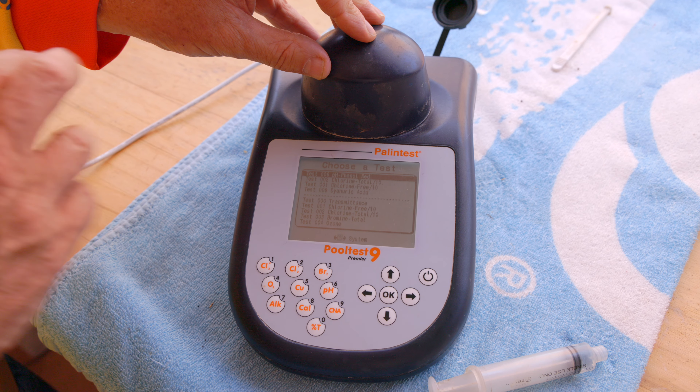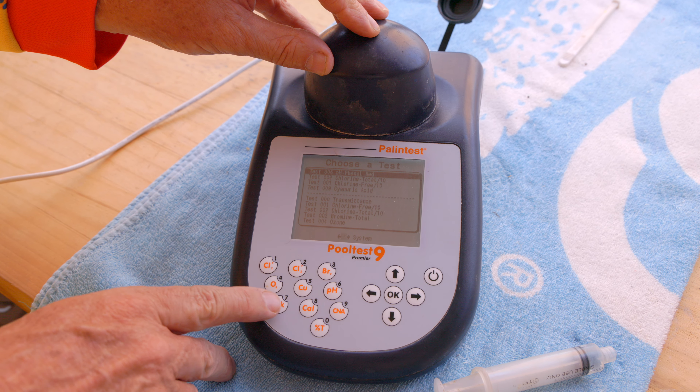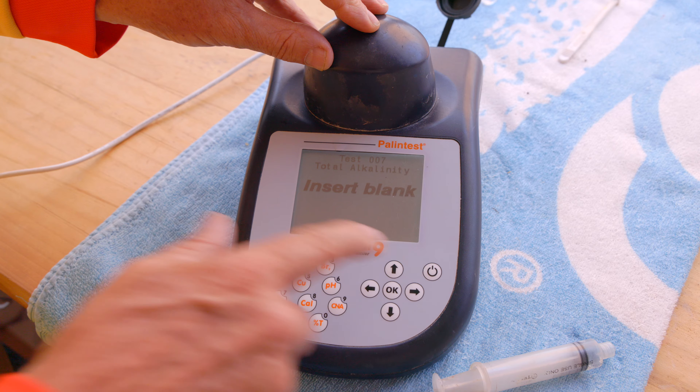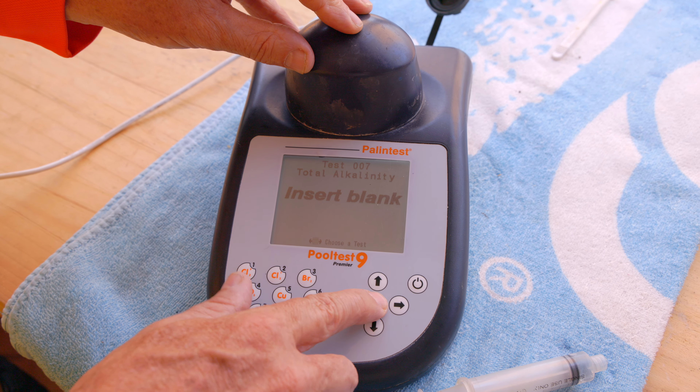This time we're doing our alkalinity test, so we want button number seven alkalinity, then we press the OK button. We've inserted our blank, we then press OK.